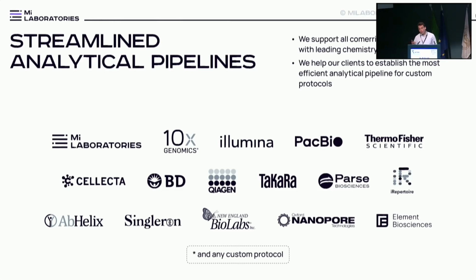And we support all types of analysis, like DNA, RNA, with or without molecular barcodes, single cell, etc. I'll cover this briefly in the next slide. And as usual, if you have any custom library preparation protocol, then you can adapt the MiXCR pipeline to use it with your sequencing protocol.